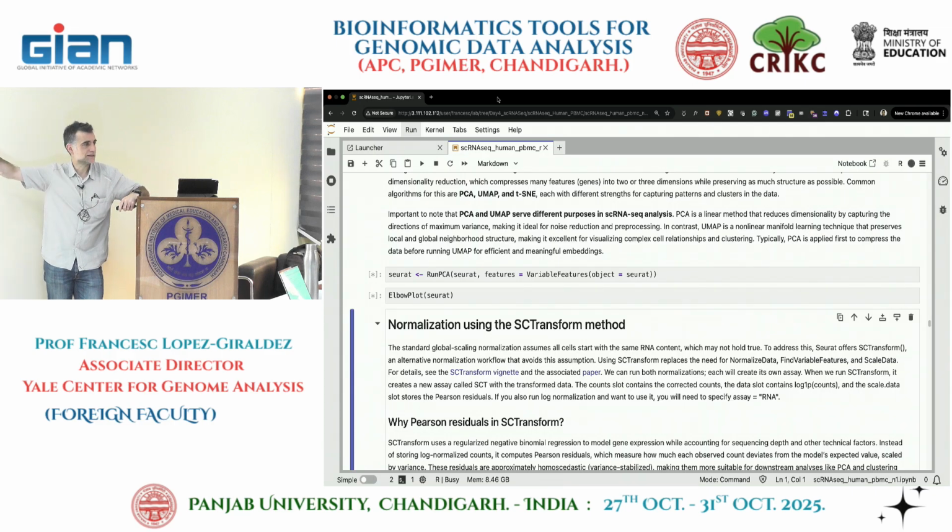So plot the next thing, the elbow plot. The elbow plot is the same as or similar to the scree plot. Remember yesterday the bar plots where we were saying PC1 explains certain percentages of variability, then we have another, and it goes down? Remember that scree plot? So this is similar. It's doing the same thing.